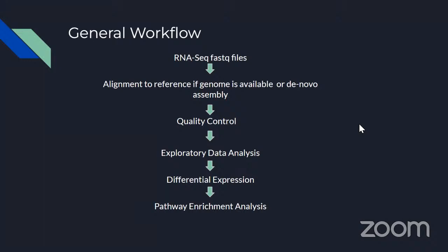What I put in this slide is the general workflow that is mostly followed in RNA-seq. The idea is that we get RNA-seq FASTQ files after sequencing.